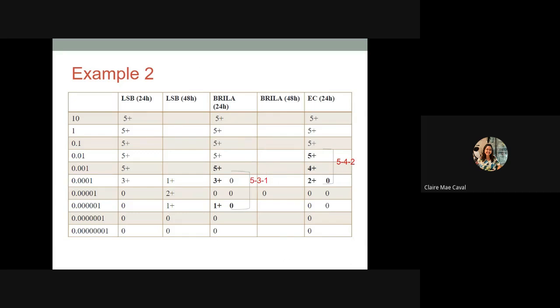So this is another example. These are the last three positives. So, for example, class, a 0 was skipped, so you just have to add it, okay? Anyway, do not go deeper on this. You will be able to learn this in the actual setting if you work in a water lab. I wish I could really discuss these examples thoroughly, but this is best explained and discussed in the actual setting, if we have a lab demonstration or actual setup or processes. So always remember, it's always the last three dilutions.